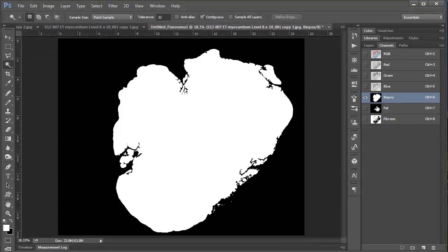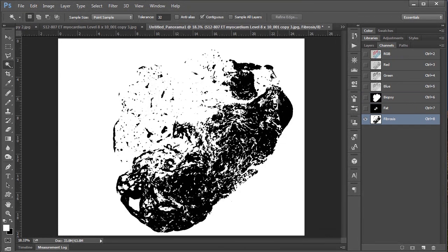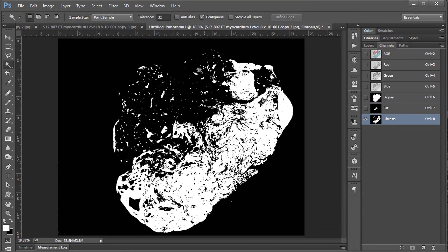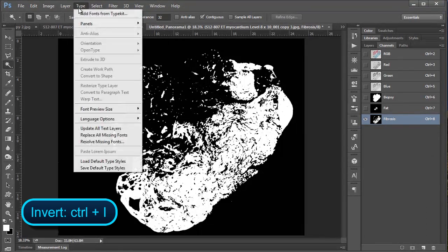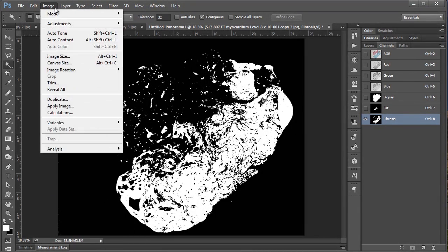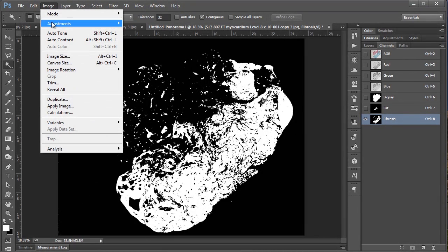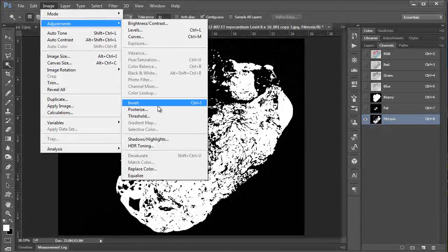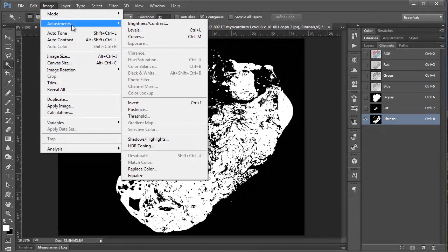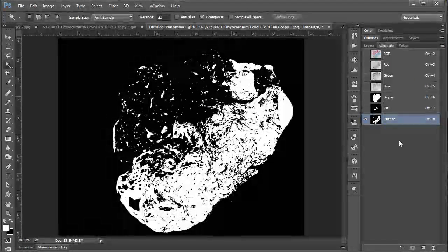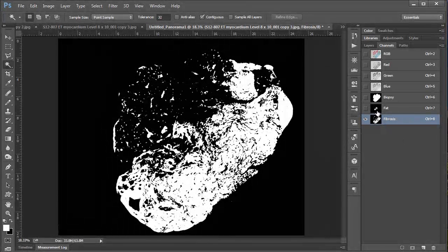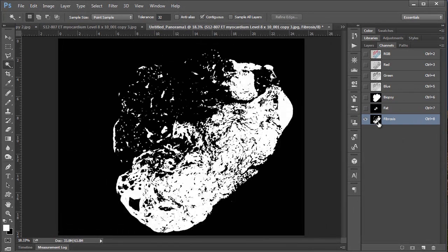And just to be consistent with my other channels here, I'm going to invert this by hitting control I. Or where is it? I use control I so often. Yeah there it is, under adjustments and invert. So now I have my three different selections.